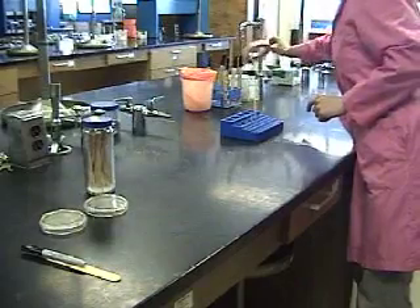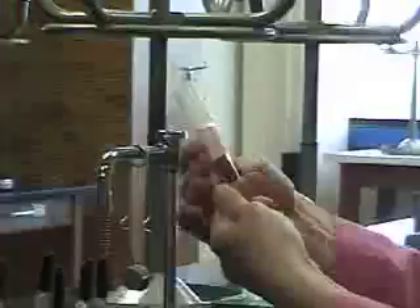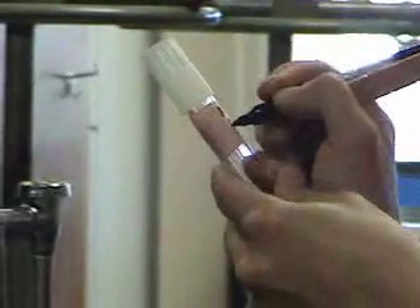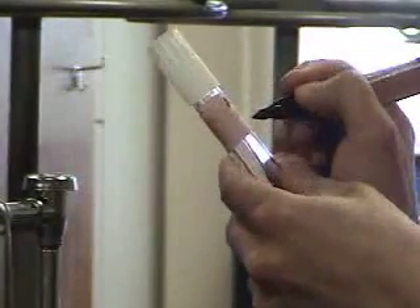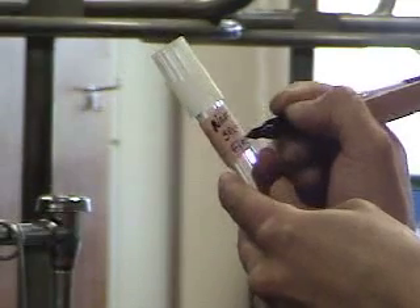For the third activity that we'll be doing, we'll be using liquid TSB broth. In order to label this, make sure that you always apply tape to the tube first and then write on the tape rather than the tube itself. Again, label this with your name and section number and the identity of what's in your tube.